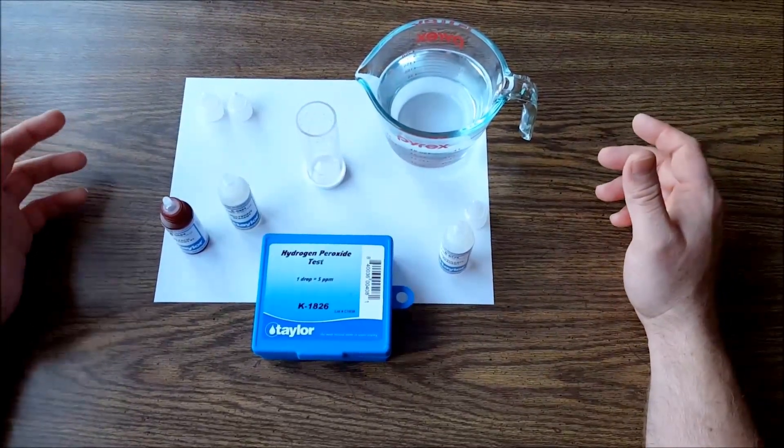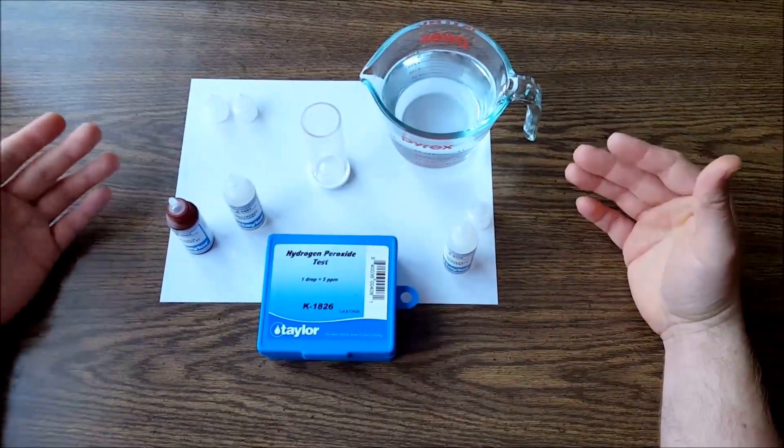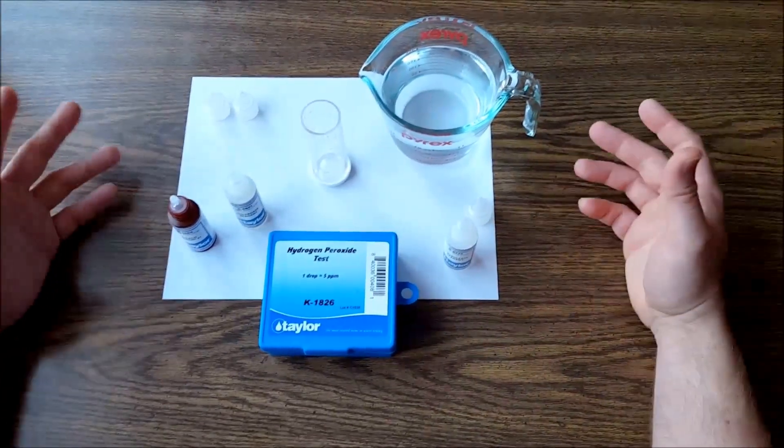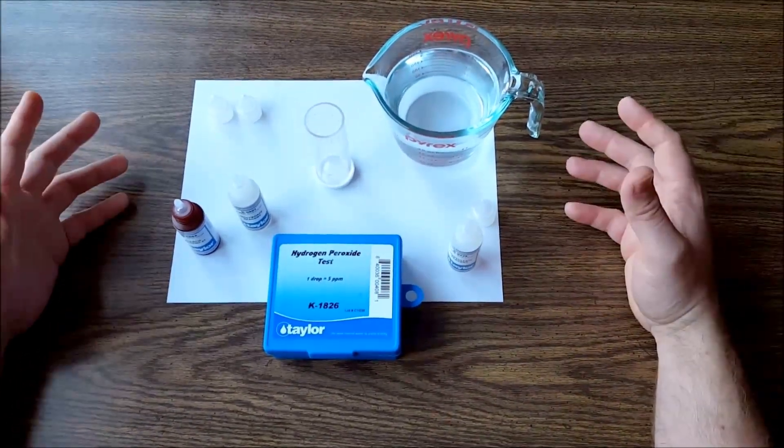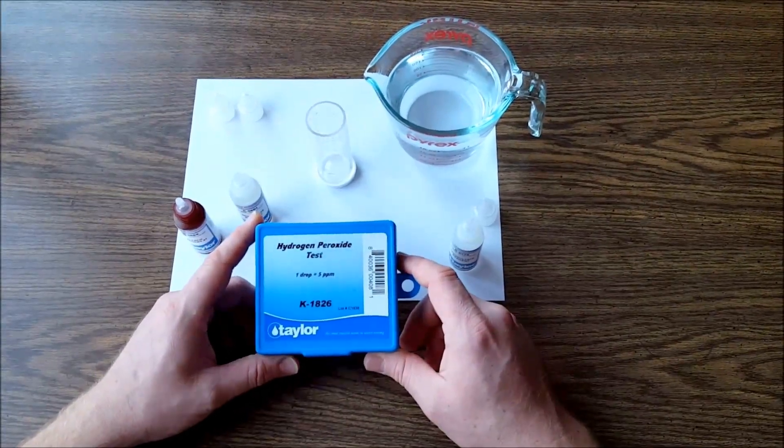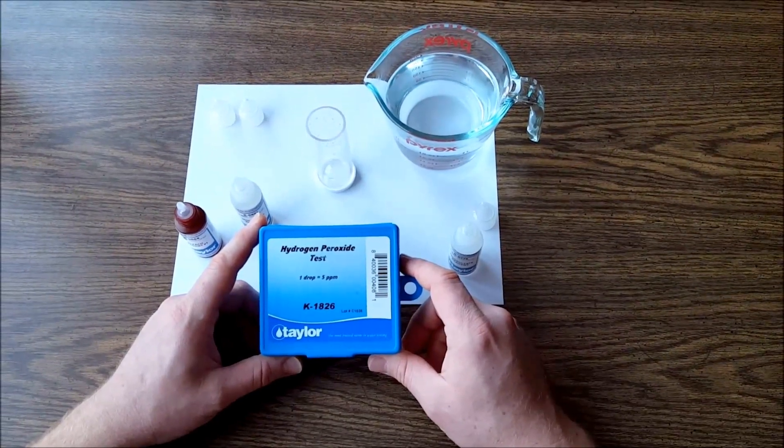If you're using hydrogen peroxide inside of your float tank, you're gonna have to have some means to measure how much hydrogen peroxide is inside your float tank. With parts per million, there's test strips out there but they're not accurate. However, this Taylor kit right here, the k1826, is accurate for float tanks.